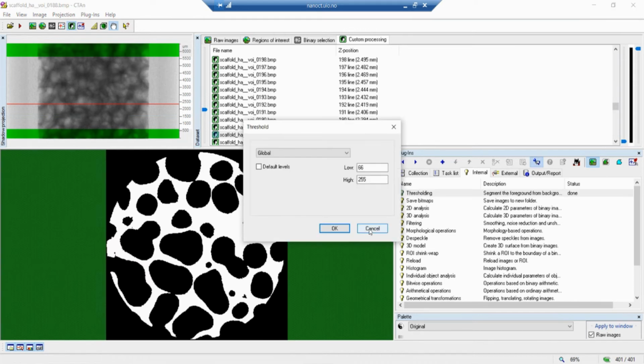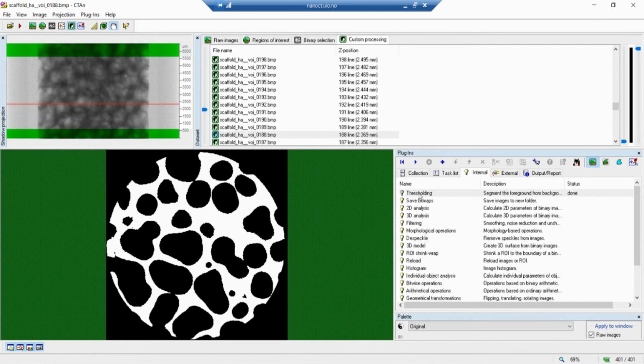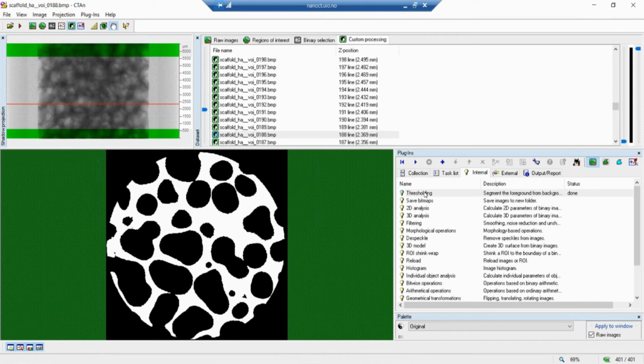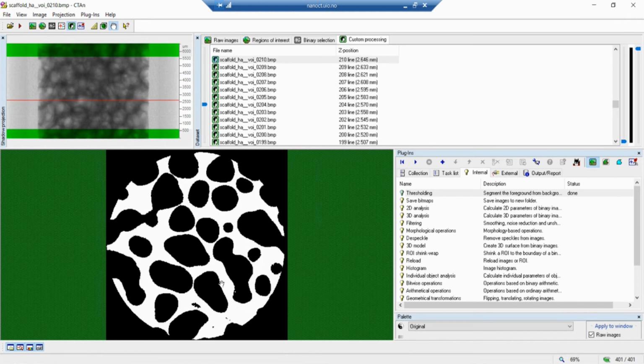So this is working, it's okay. So I haven't put in the task list, so I will do it now. Now it's here.